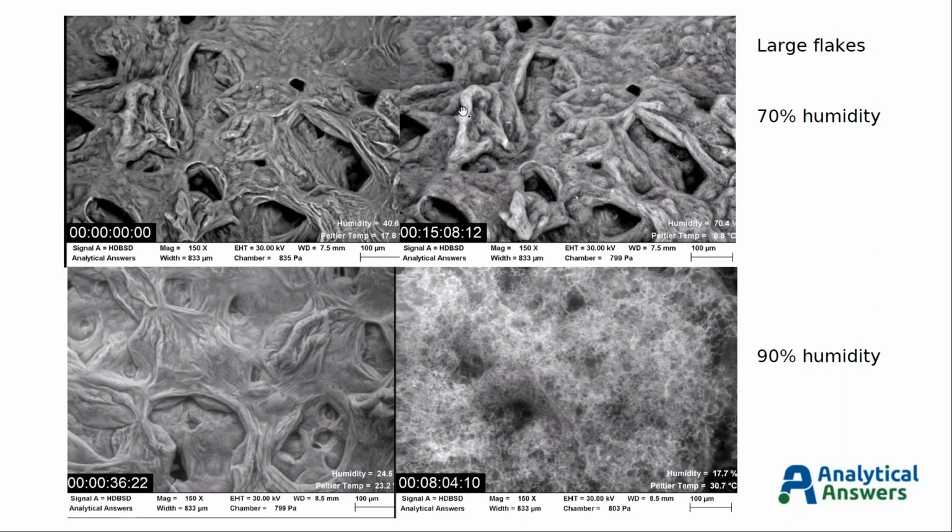But when we compare the stills before and after, you can see that there is a definite swelling to the entire surface of the sample, but it clearly doesn't go through the same change that we see at the 90% humidity, where when we look at the before and after stills, it's a huge difference between the two, although you can still see some vestiges of the original structure in the material. It is basically fully reacted.